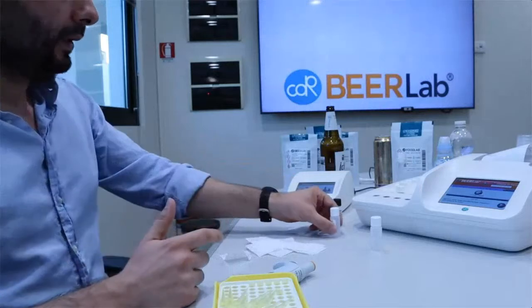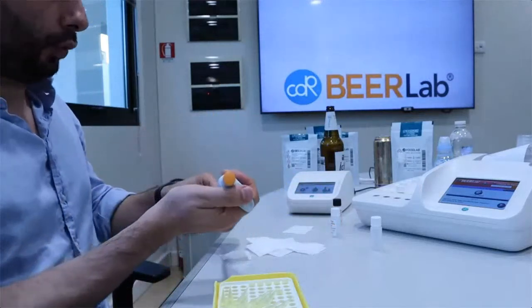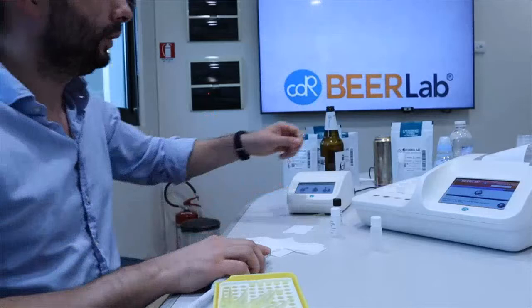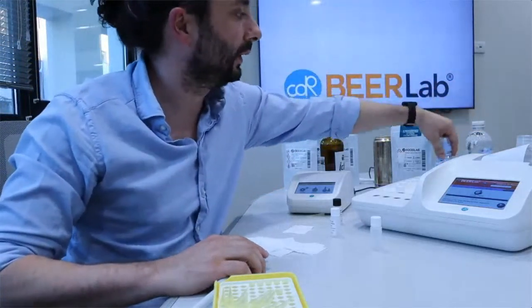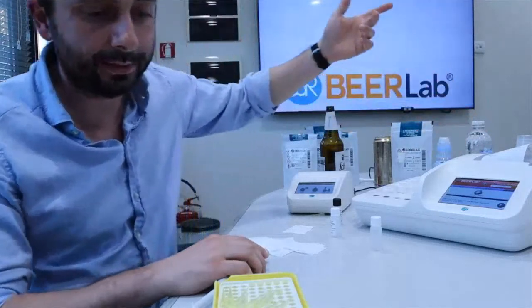So, in the meantime, as I told you before, we can do an analysis of the water. We have two kinds of water here, and we can analyze them.